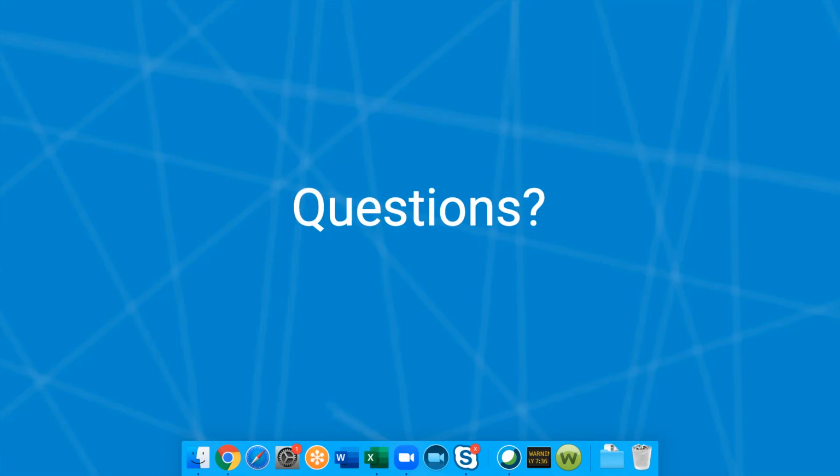So if you want to set up your jobs so that one job needs to be finished before another one, that's something that we're going to look at enabling. But of course, we understand that a lot of other laboratories would prefer to do work concurrently, and so this would be an administrator setup that could be defined by the teams and what their workflow should be.